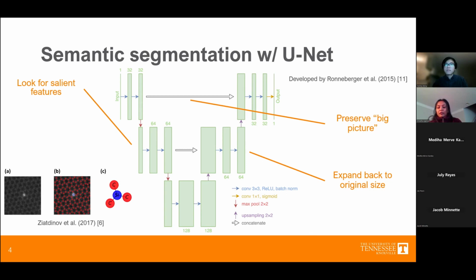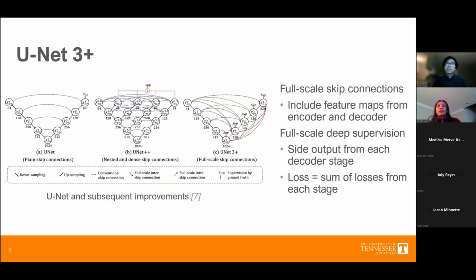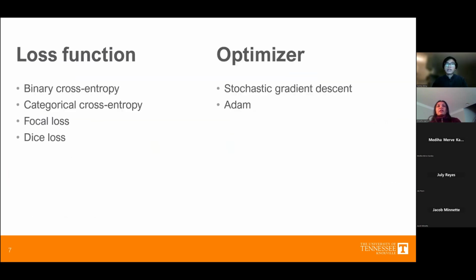Another thing is, you talked about the difference between binary cross entropy and categorical cross entropy. In the categorical cross entropy, you added some kind of weights, because here you have positive pixels as your positive class, and your negative class, which is your background, is higher in number. So have you tried this in practice? Because in the paper that I published, the categorical cross entropy in the UNet did not provide any great result.